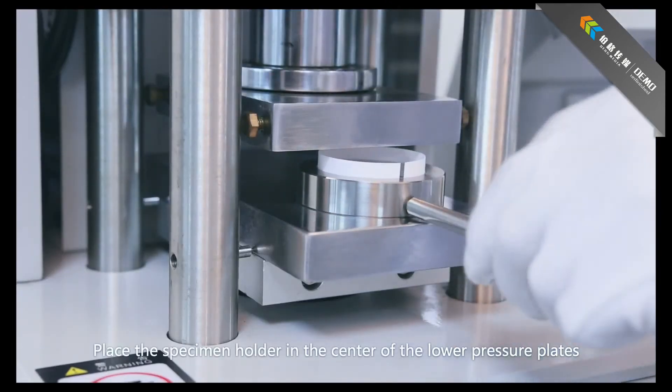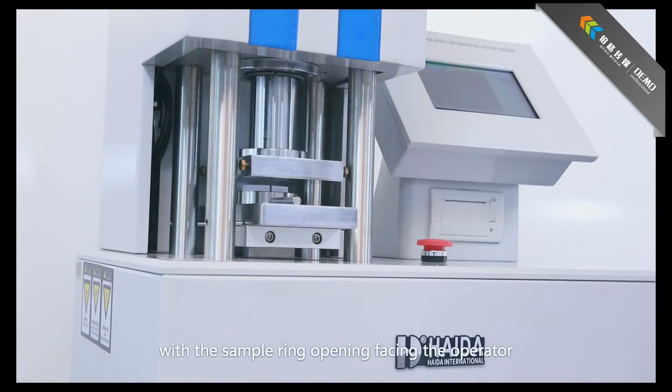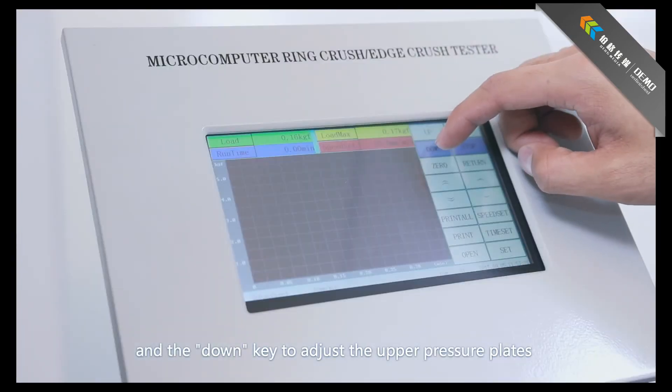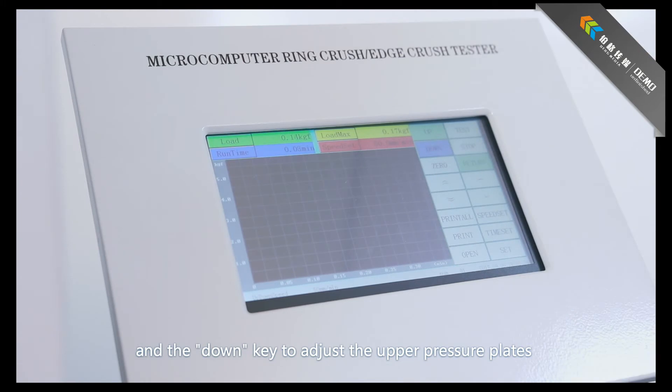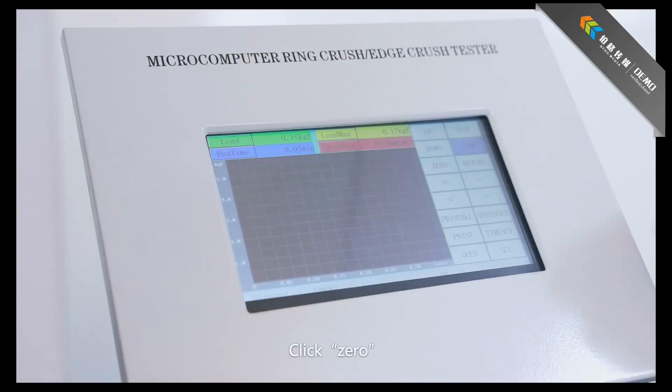Place the specimen holder in the center of the lower pressure plate with the sample ring opening facing the operator. Use the down key to adjust the upper pressure plate until it approaches the specimen, then click Zero.